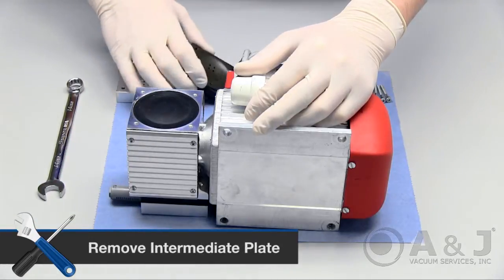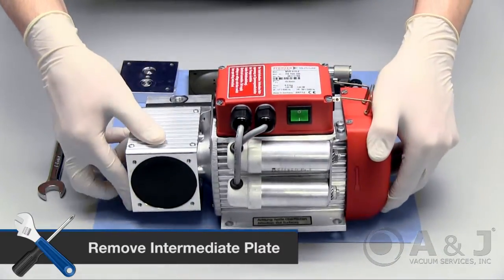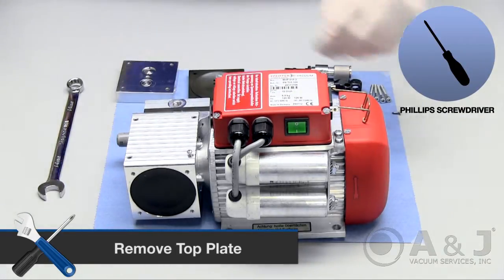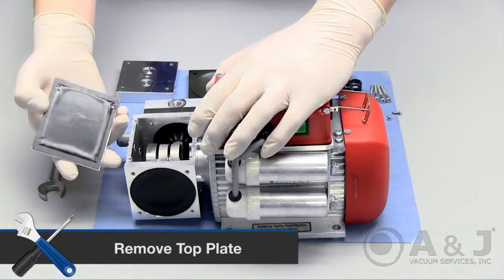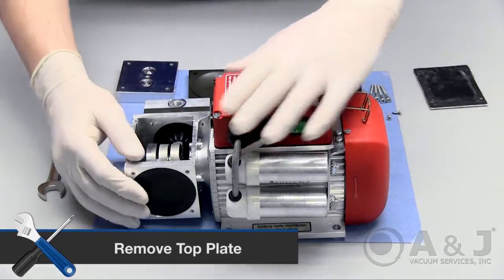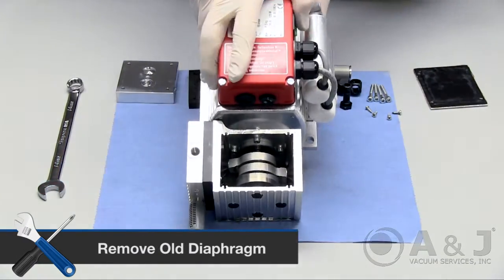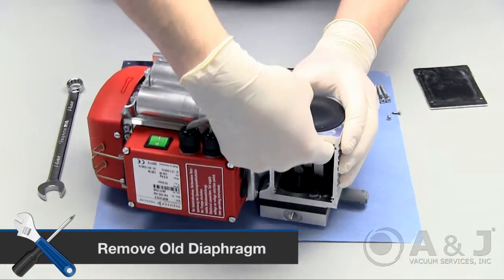To access the diaphragm, remove the intermediate plate and turn the pump back over on its side. Remove all the screws on the top plate with a Phillips screwdriver and place the top lid to the side. Turn the pump over and reach in from the inside of the crankshaft housing to start the removal process of the old diaphragm.